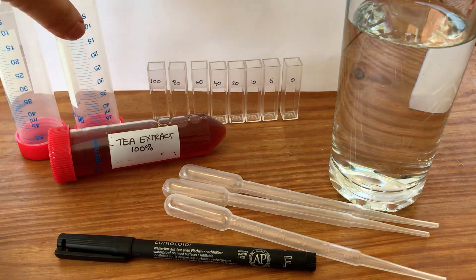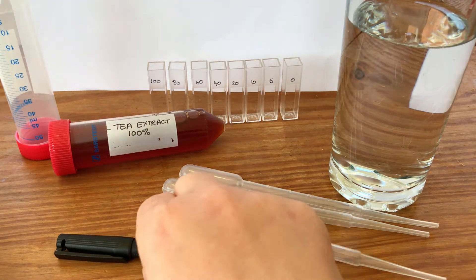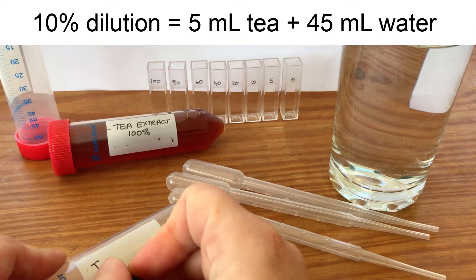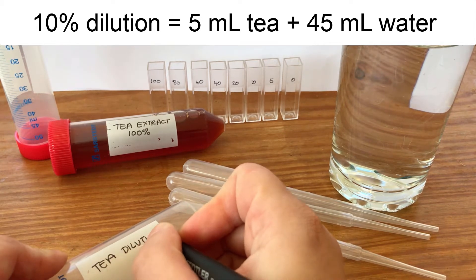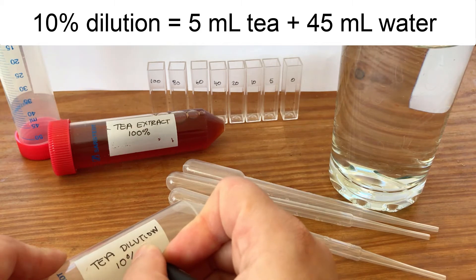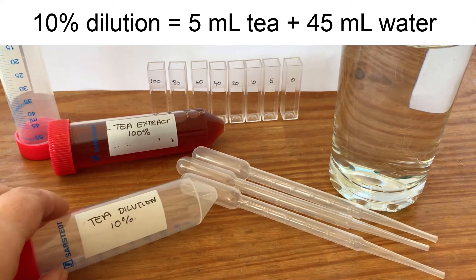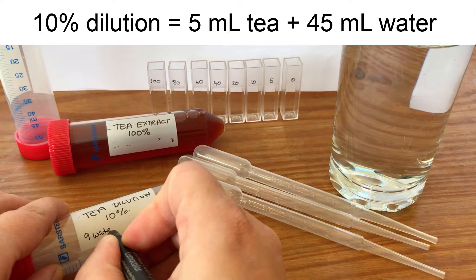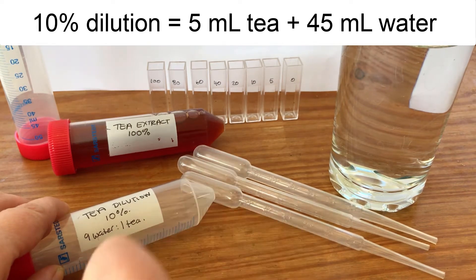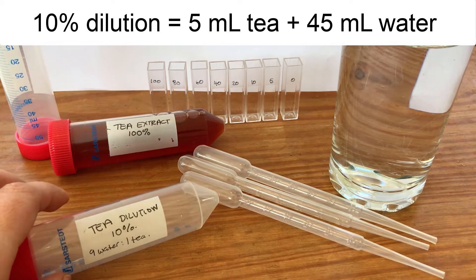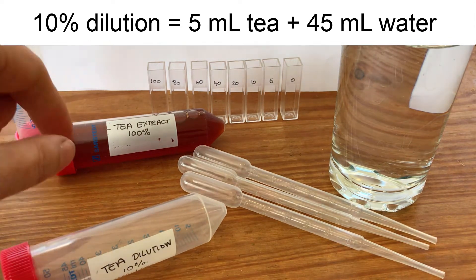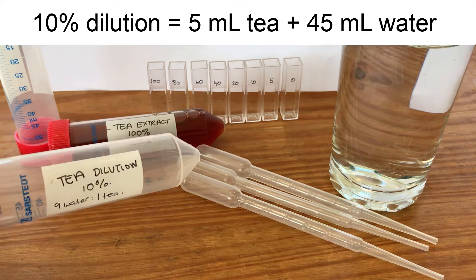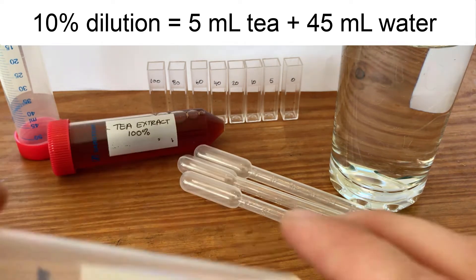So just let that tea cool. Before I make up my smaller dilutions I'm also going to make up a tube of 10% tea dilution. 10% dilution means we've got nine parts water to one part tea. In this 50 ml tube I'm going to put 5 ml of the tea extract in and then dilute that with 45 ml of water to get 50 ml of 10% diluted tea.